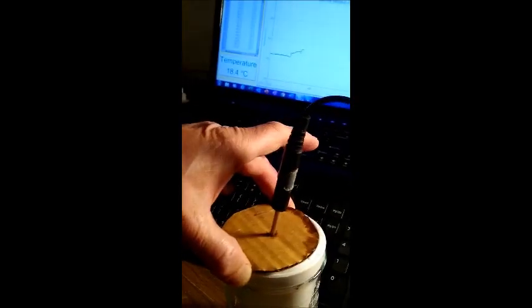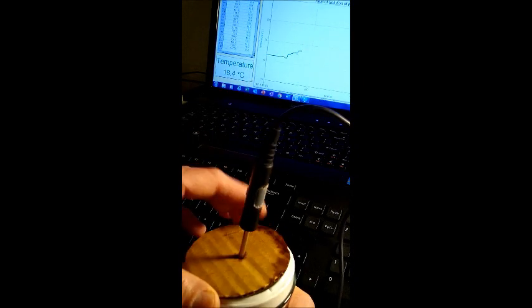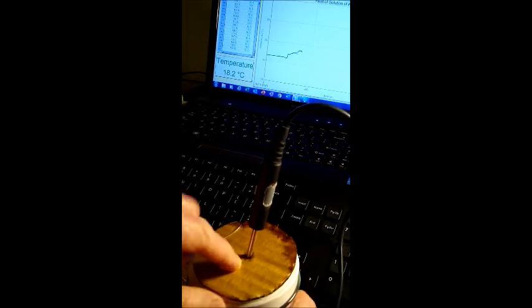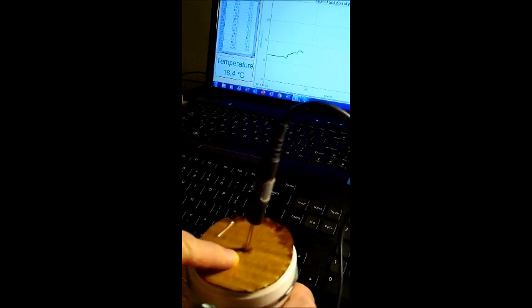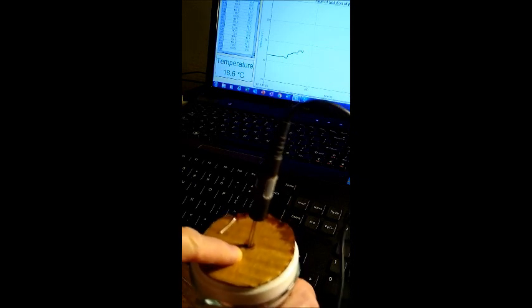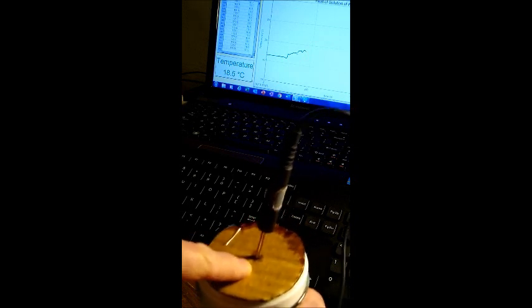This would be, like I said, on a hot plate, and I would be mixing it. It looks like it's dissolving. Now again, this is a basic solution, so I've got to be careful. This is not excellent lab procedure, but I'm in my basement trying to acquire some data here, not really in a lab setting.